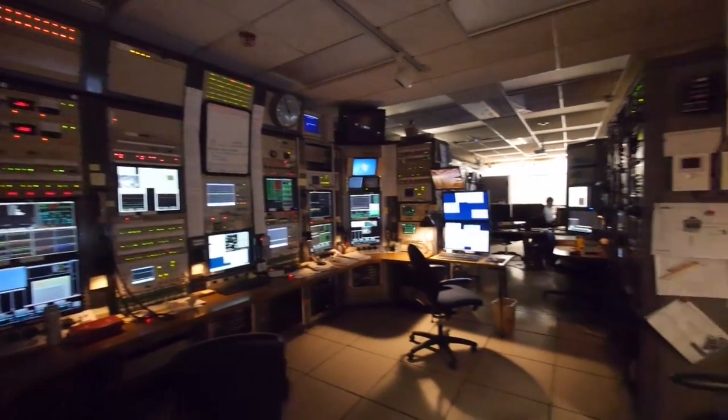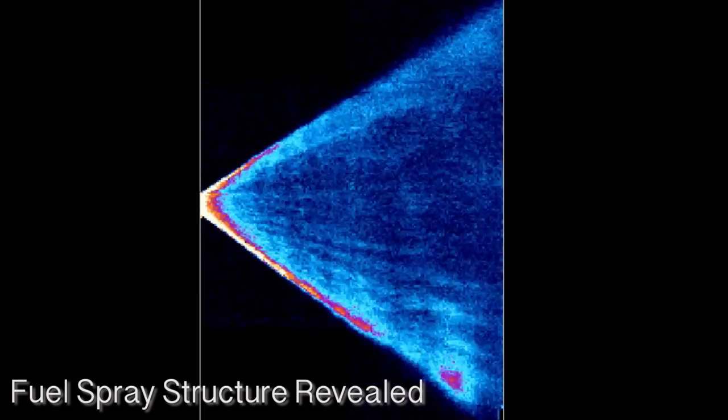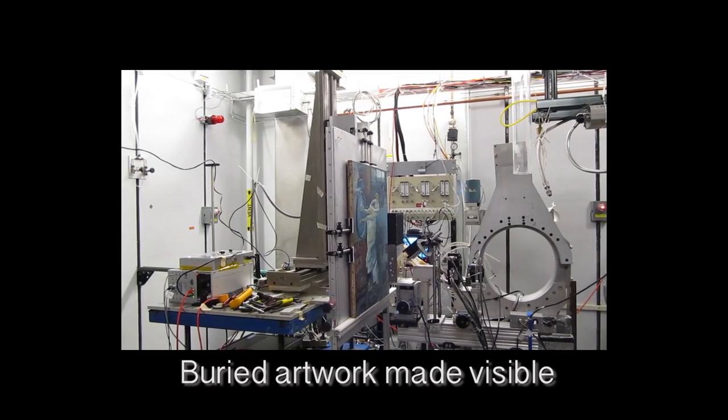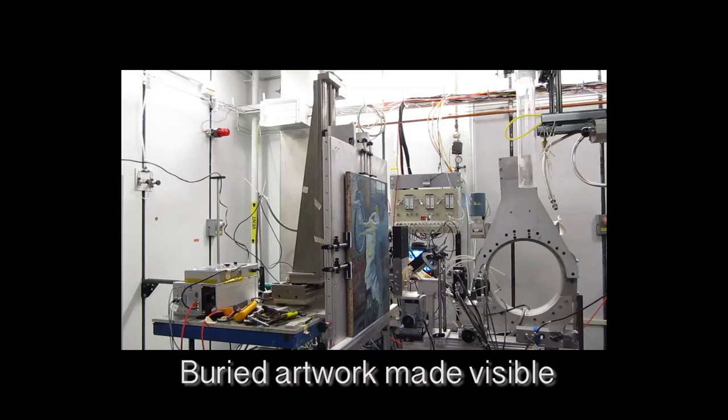MacChess optimized the experimental station for macromolecular structure determination. The two organizations collaborate on things like detectors and in-hutch optics, and MacChess provides data analysis support and additional personnel in the hutch to facilitate macromolecular users.